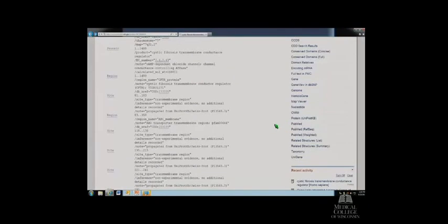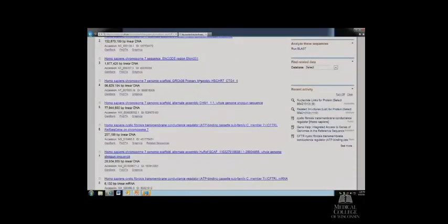And now if I want DNA sequence data, so I'm actually going to jump into nucleotide and end with our third database here. So the nucleotide records, if I click on it, it's going to find all the records that are related to that particular protein. So there's more than one, but I'm going to scan through my list, and the one I want is the Homo sapiens CFTR RefSeq gene on chromosome 7.